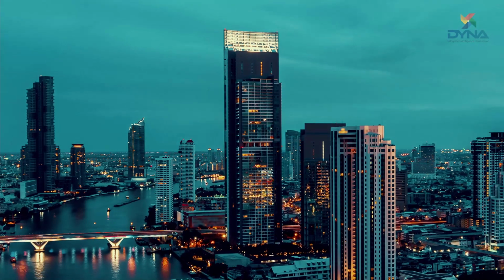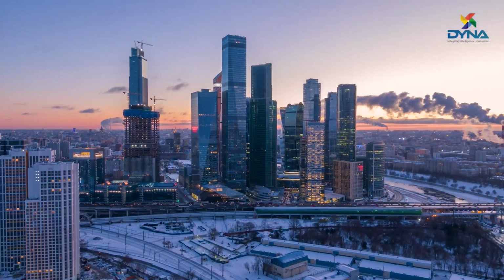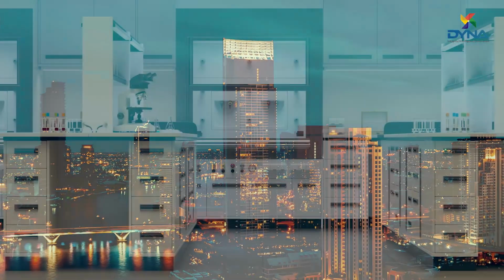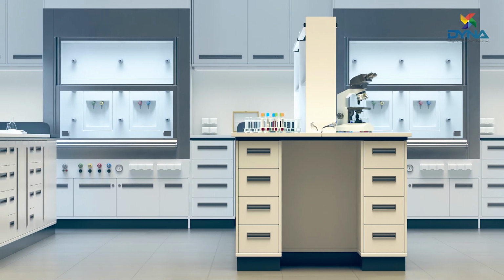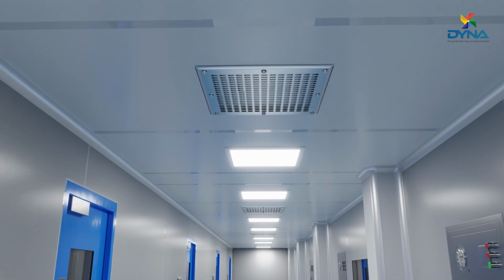The ambient air outside in a typical city environment contains 35 million particles per cubic meter, corresponding to an ISO 9 cleanroom, which is at the lowest level of cleanroom standards. Dyna's cleanrooms show no ingress of dust, even in locations where the atmospheric temperature rises above 45 degrees Celsius.